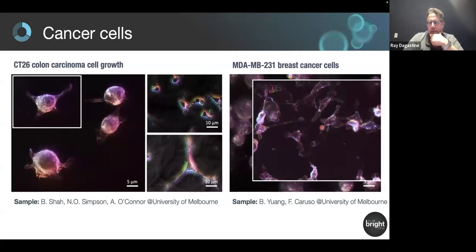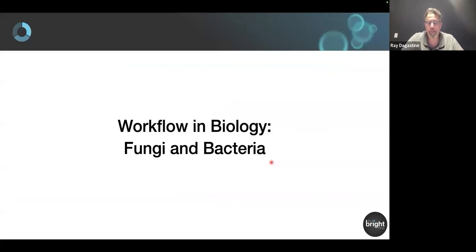This is just a different cancer cell where you can start to see they're stretched out and you're moving for mobility. We have some application notes that delve a little bit more into some of the features, but I honestly didn't want to tell this audience about features for cells because I felt like you'd be telling me. But it's interesting when you start to look at a host cell, the types of things you can identify even without fluorescence. So in a sense, cells are large. You can see the evanescent wave penetrates, illuminates the whole cell, even though it could be several microns tall.